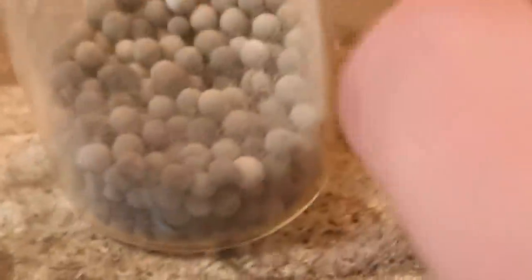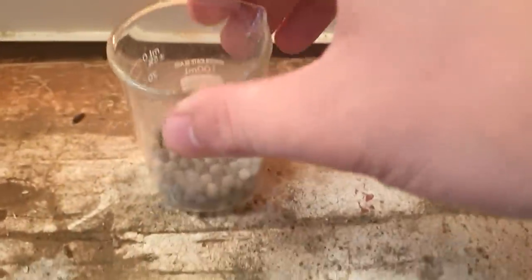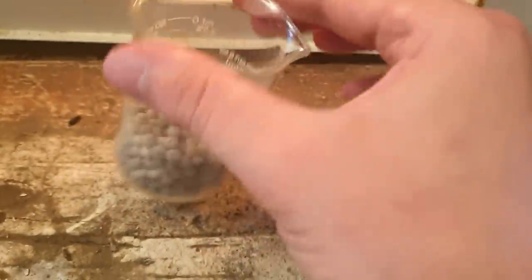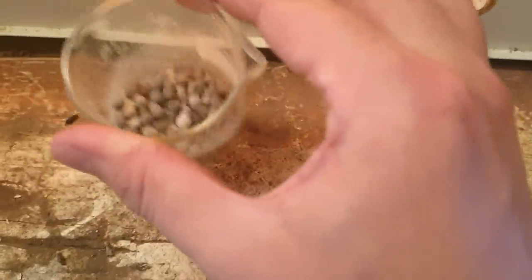Oops, I accidentally set one on fire. I think it was that one there. It just started glowing very orange. So yes, 10 second burst at most. Oh, it's very hot. These are looking pretty damn dry. There's not really much water coming off and they're very hot. So I'm gonna cool these down over vacuum, which should get the last little bits of water out.